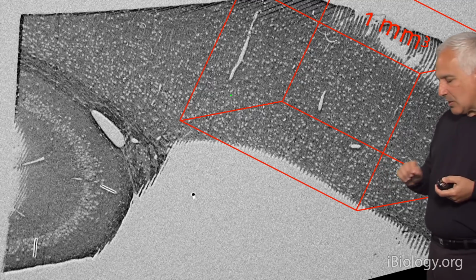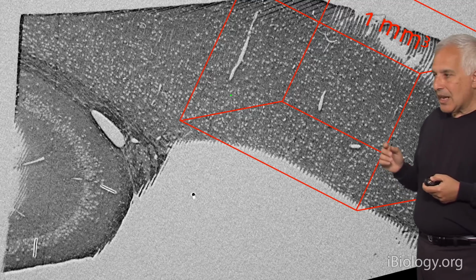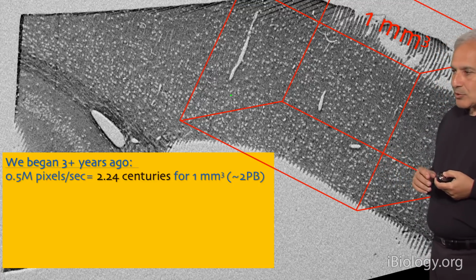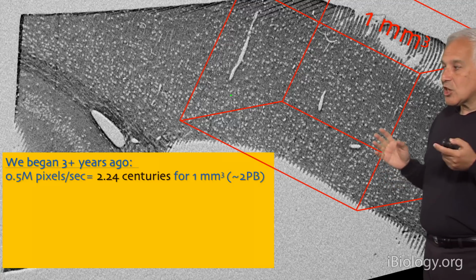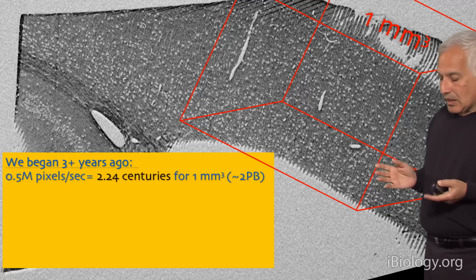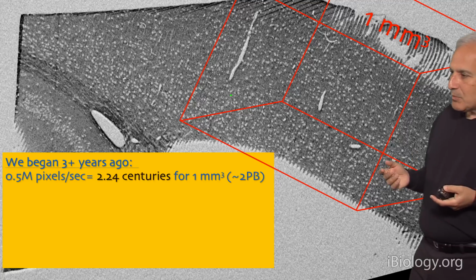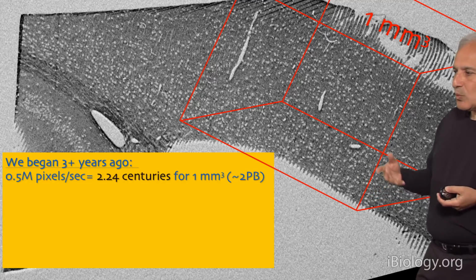Even taking the images, much less coloring them in, just taking the images takes time. If we wanted, let's say, to do a cubic millimeter, at the rate we were going when we began doing this work over 3 years ago, we were doing around 500,000 pixels per second in our imaging, and that would require us to go about 2.24 centuries just to generate the data for a cubic millimeter, and that would be about 2,000 terabytes. And no graduate student I met was interested in this project for obvious reasons, because they knew I would be dead by the time they finished, as well as them. So this was not possible to work at those speeds.